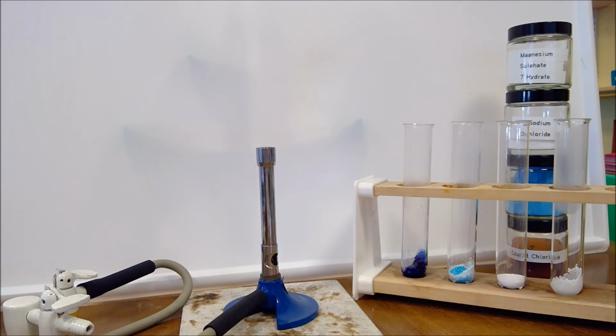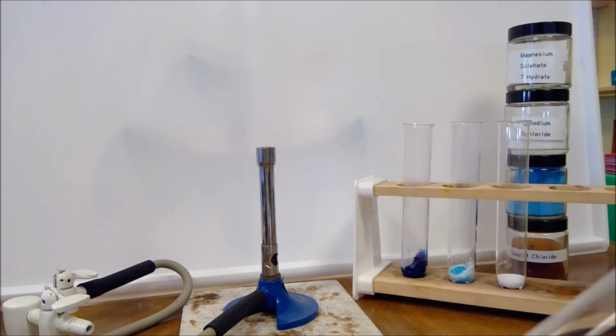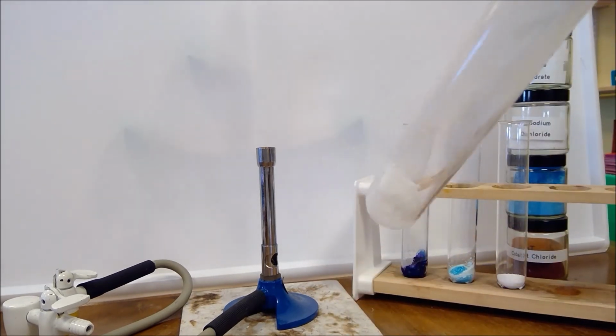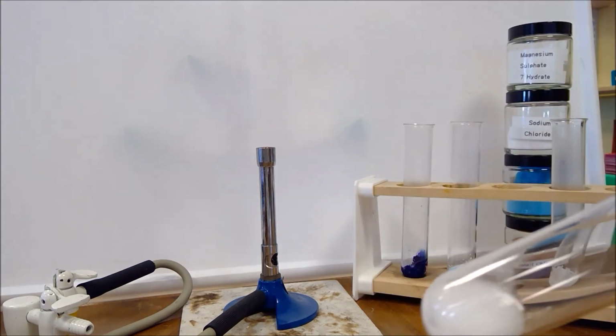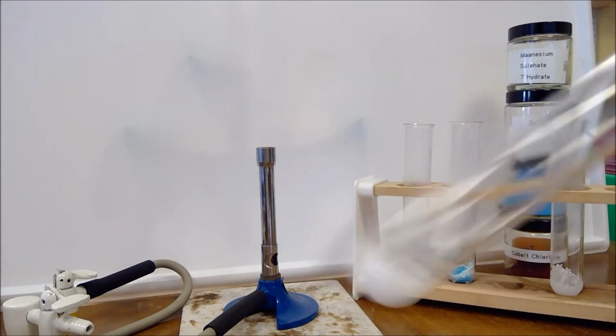So our final step for each of these was to add a few drops of distilled water to see if we notice any change. So a little bit of distilled water in there. And then into our sodium chloride. You might think what you expect to see with that one. Okay, I think we're just managing to dissolve some of it back up there.